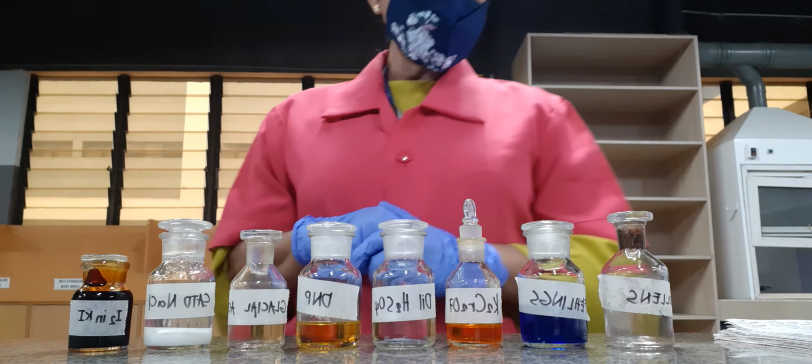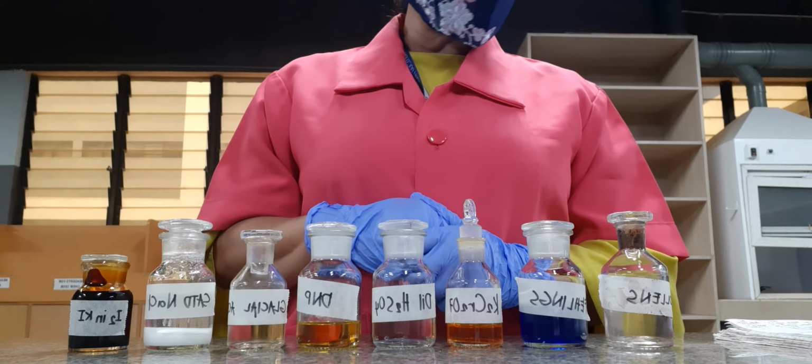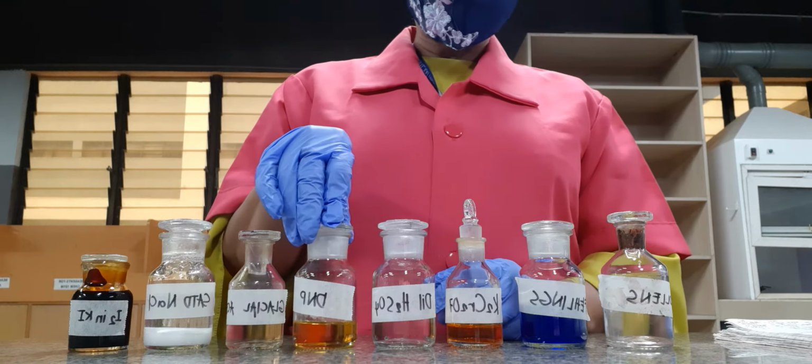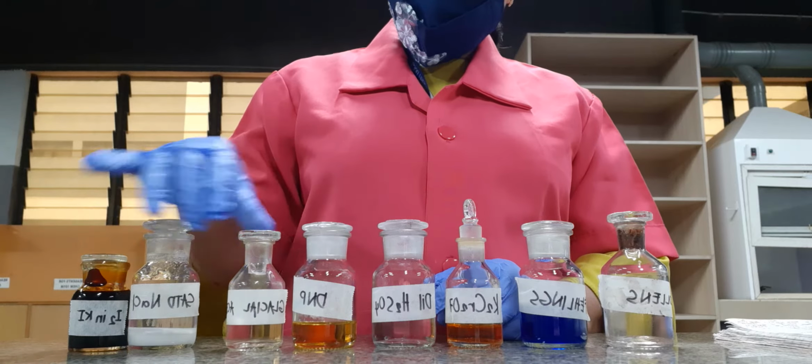Okay, so our next test is the DNP test, which means this is a reagent containing 2,4-dinitrophenylhydrazine.